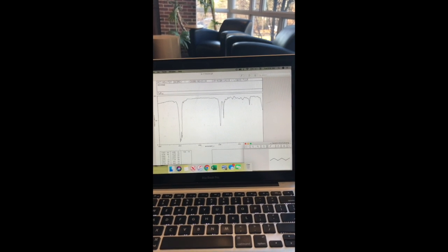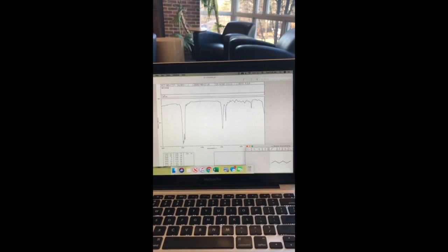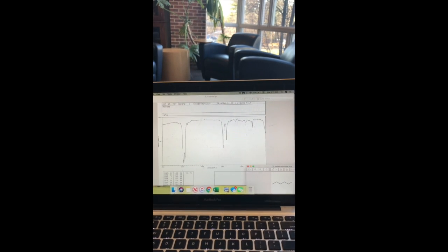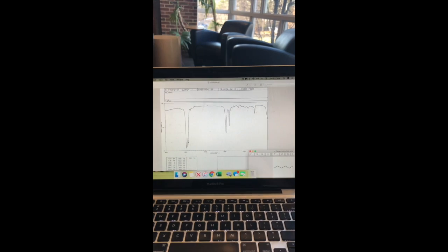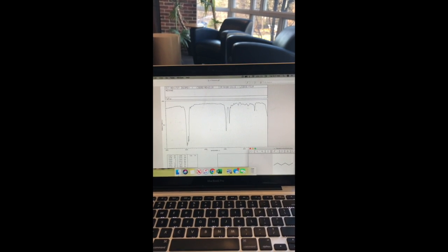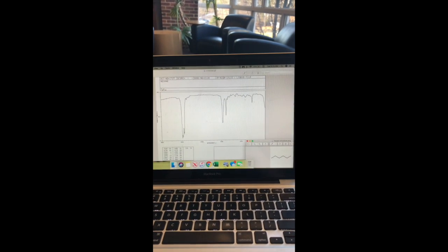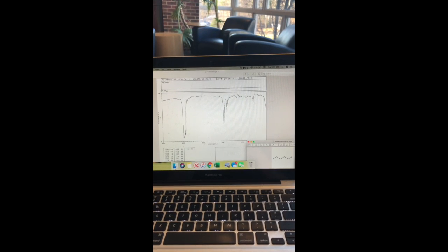Now, what is IR spectroscopy? IR spec is a diagnostic analytical tool used to confirm the presence or absence of an organic molecule by identifying the constituent functional groups. The instrument does this by sending a beam of high energy infrared light through a given sample. This input of energy causes the bonds between individual atoms to vibrate, resulting in stretches and bends. These stretches and bends can then be characterized by evaluating the spectrum generated by the instrument.